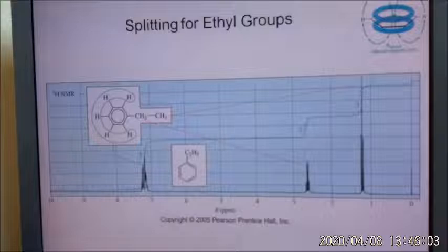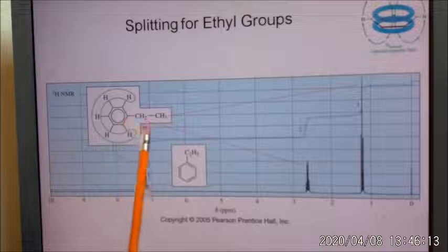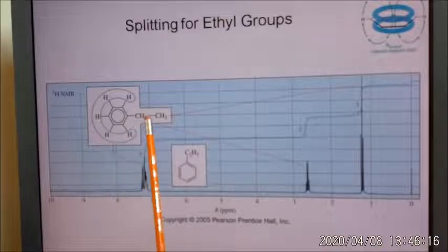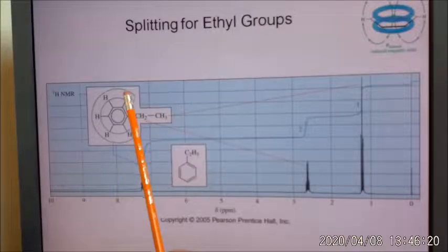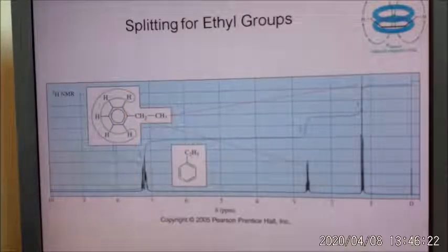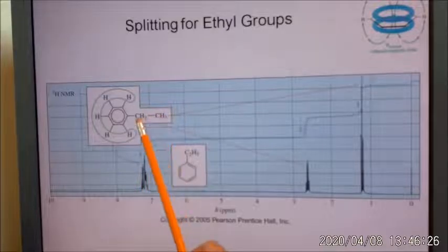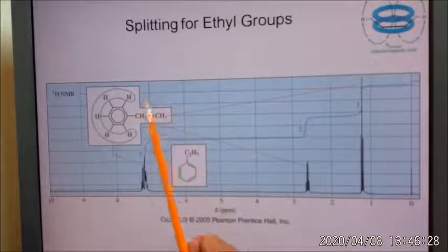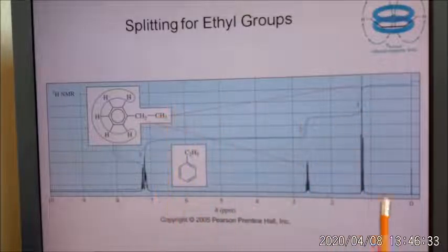Okay, so let's take a look at this. Look at ethylbenzene. Well, I think you've seen this guy before. All right, ethylbenzene, I have an ethyl group. And if you look at this carbon, this hydrogen to carbon is 1 bond, 2 bond, 3 bond, 4 bonds. So you're not going to see influence. You're going to see just 1, 2, 3. So this hydrogen to carbon, hydrogen, that's 1, 2, 3. That's a J3 coupling. Okay, so see this?